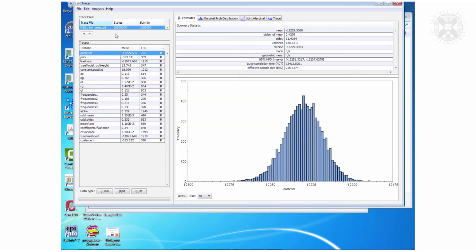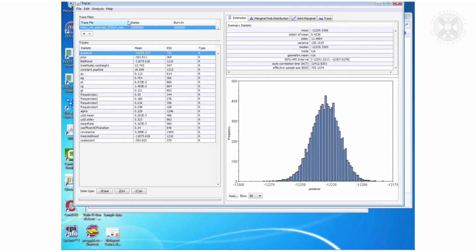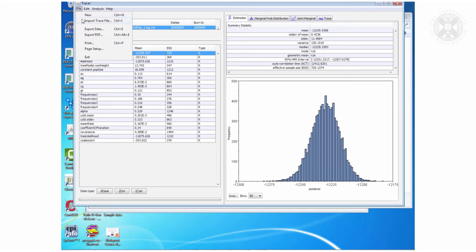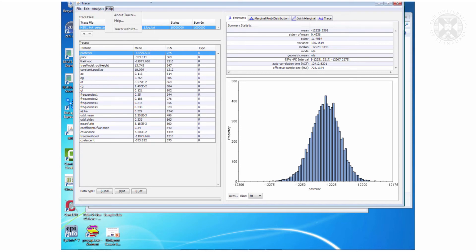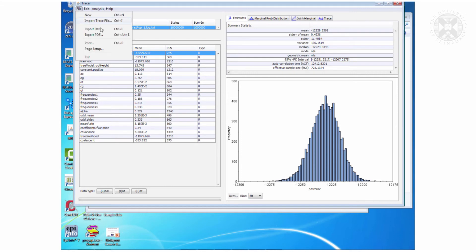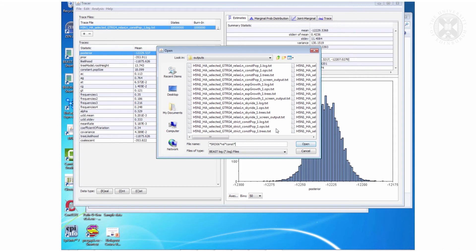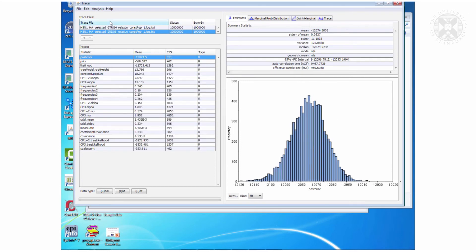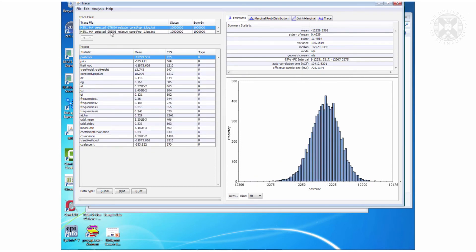And then from here I can open another one as well. So this was the GTR model with a relaxed log normal clock and constant population size. So now I will open similar, in fact the one you generated, and now if I click both of them I can compare.